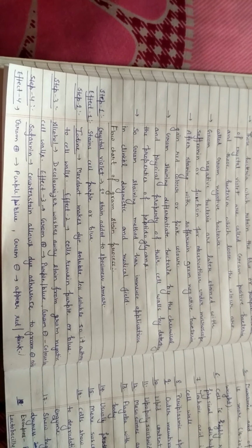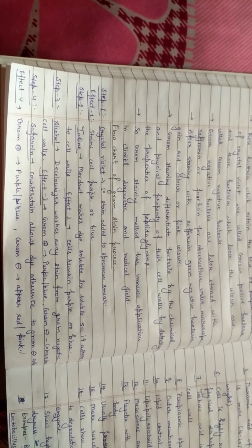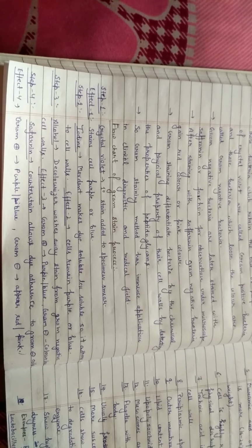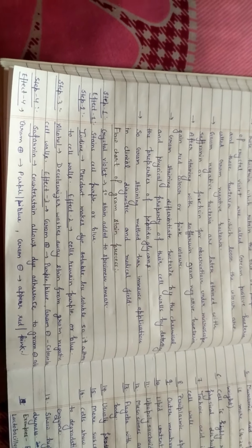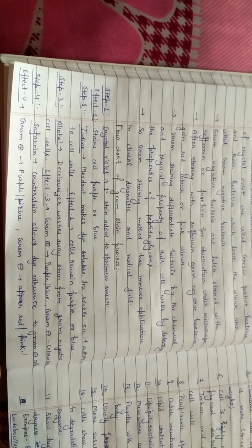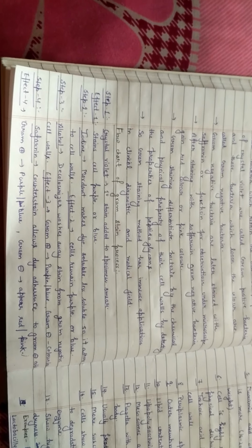After counterstaining with safranin, which is the last step, gram-negative bacteria become red or pinkish in color, and gram-positive bacteria remain purplish or bluish in color. This was the whole process. There were four steps. It is the main process which differentiates between gram-positive and gram-negative bacteria.